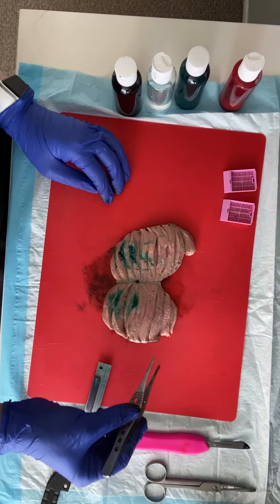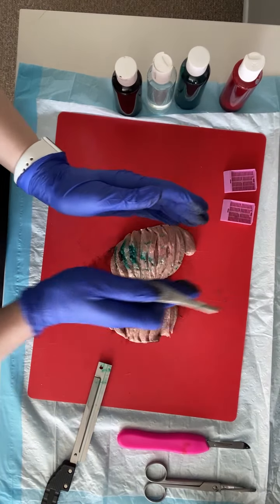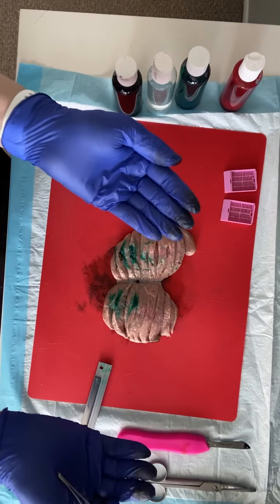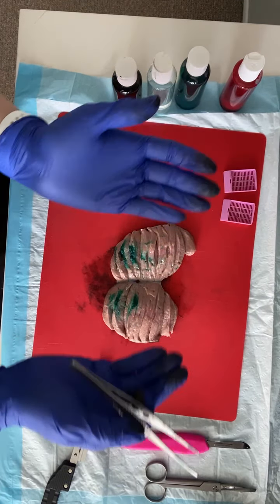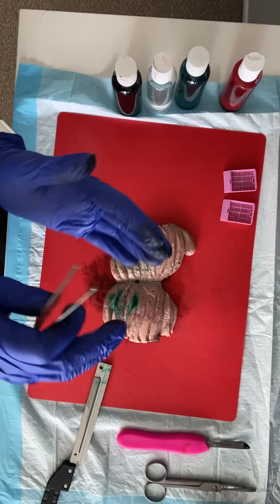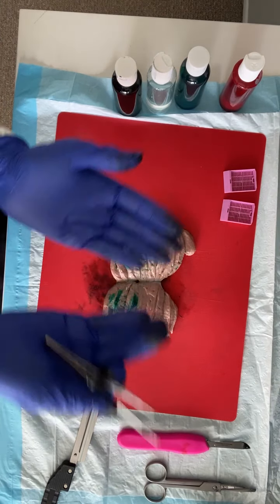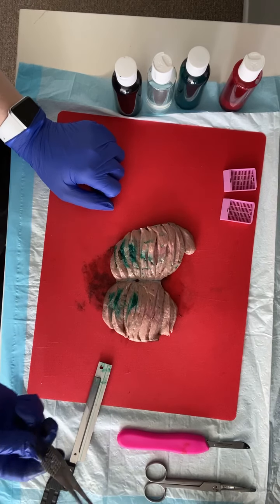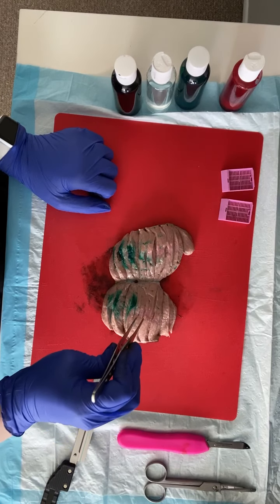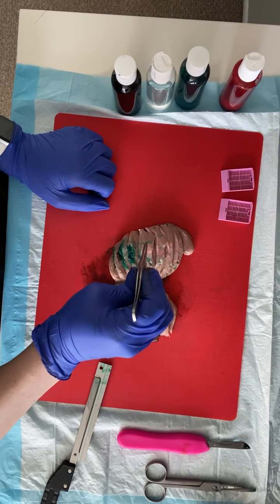A lot of times, unless a lesion is incredibly invasive, the tunica vaginalis will completely peel away once you bivalve through your specimen, so you won't necessarily be able to take a measurement of the closest distance. In that case, you would say the lesion is blank centimeters from the tunica albuginea, the tunica vaginalis retracts away from the testicular parenchyma, and there is no evidence of gross invasion. That phrasing is in the sample dictation on D2L.